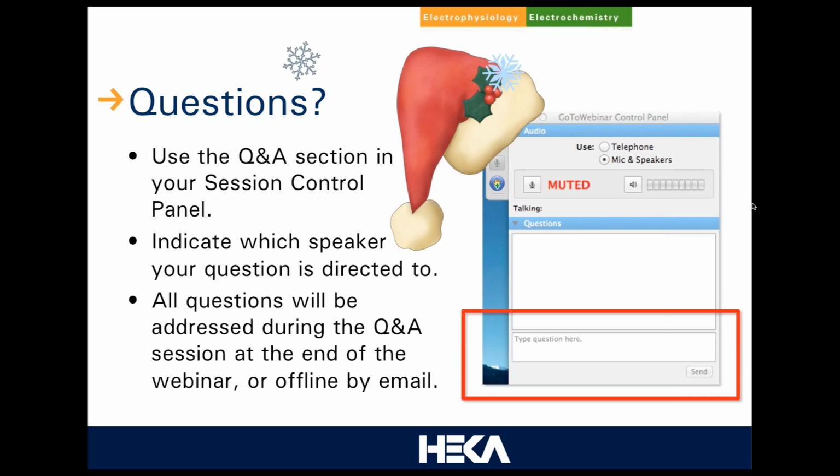I'm sorry, I don't quite understand the question. I mean, would you be able to send me some illustrations of what the problems are so we could take a look? So, if you have a PGF sequence, is it settings in the amplifier that are not behaving, or is it actually the acquisition end that's not doing what you intended to do?